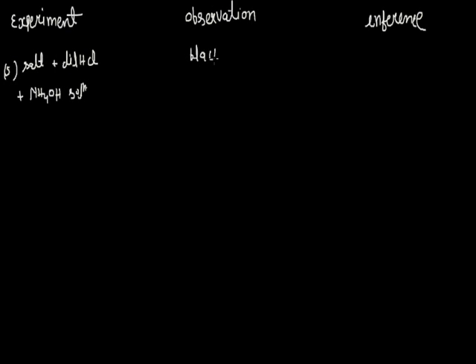Since already we are having white PPT, that will be turned into black PPT by the adding of NH4OH solution, and this black PPT is due to the formation of Hg NH2Cl plus Hg.